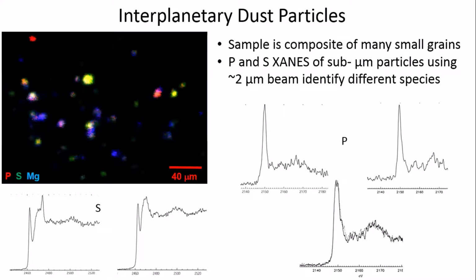I wonder if you could say a little bit more about how you're capturing spectra prior to beam damage. I didn't understand technically what you were doing back there. It looked like you were capturing the spectra in a shorter amount of time.